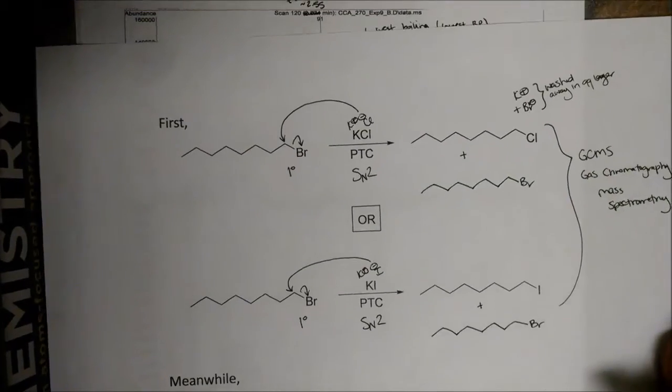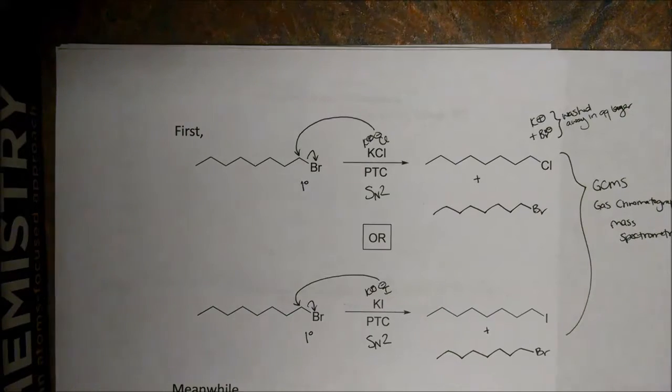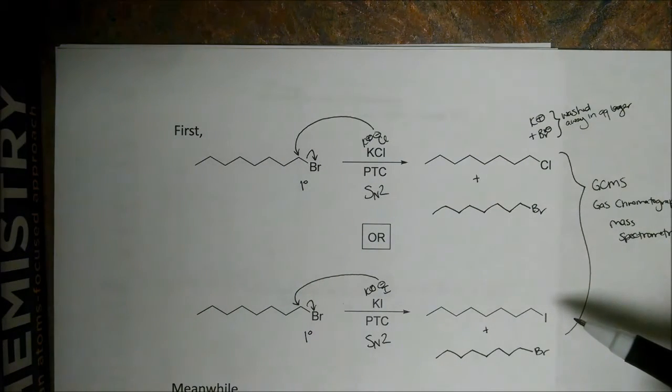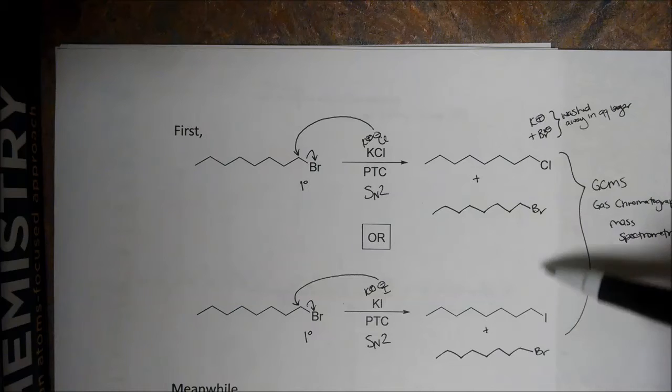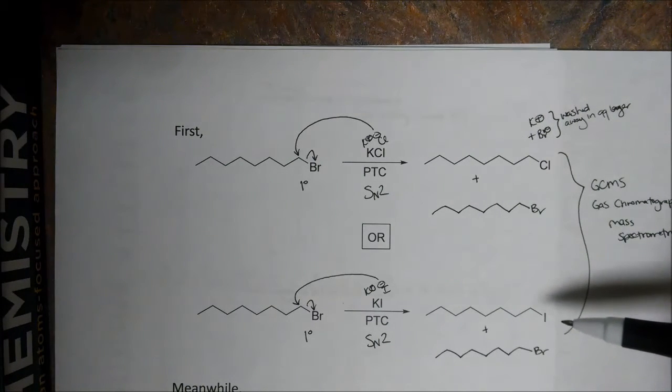So which of our compounds has the lowest boiling point? Well, let's think about what affects boiling point, right? Those intermolecular forces? Well, polarity is definitely one of them, but when we have all these halides, they're definitely similar in polarity. So the main determining factor for our boiling point is going to be molecular weight. Okay? So which of these guys has the largest or the smallest molecular weight? Because remember the periodic table?